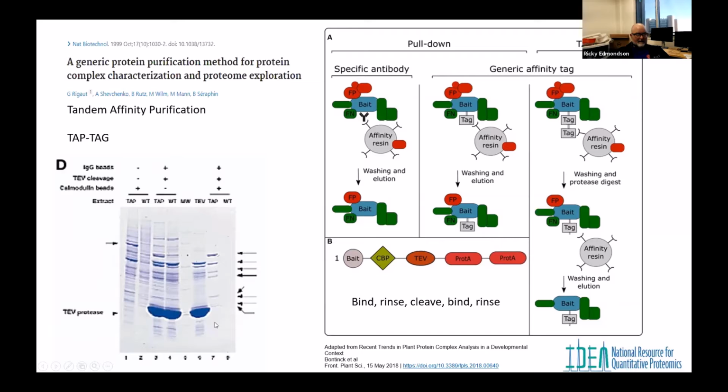And so we have a researcher at UAMS, Justin Lung, who does a lot of pull downs, and his favorite combination of tags is a FLAG tag combined with essentially an avidin linker. Using both of those in combination, they get really nice pull downs. It doesn't have to be these two, but having two different pull downs allows you to bind and rinse, and then rinse again. That really is necessary to wash away and remove a lot of the false positive binding that you get.